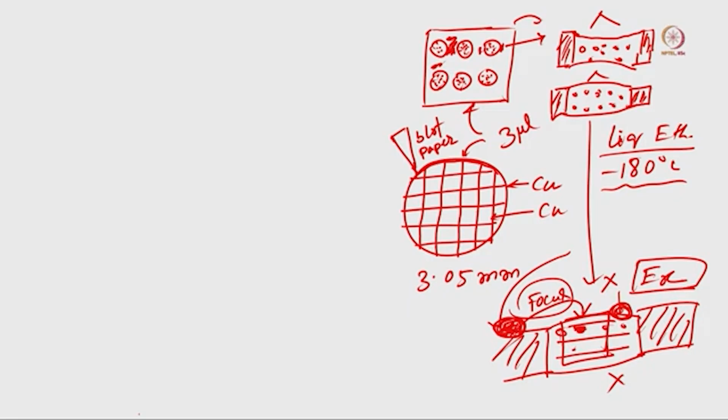That is the reason that for cryo-electron microscopy we focus in a different place, and then come back to this area and collect data. Before imaging, our sample imaging area should not be exposed to the high-energy electron beam, and it should not damage the amorphous ice or create any thermal drift in that region.